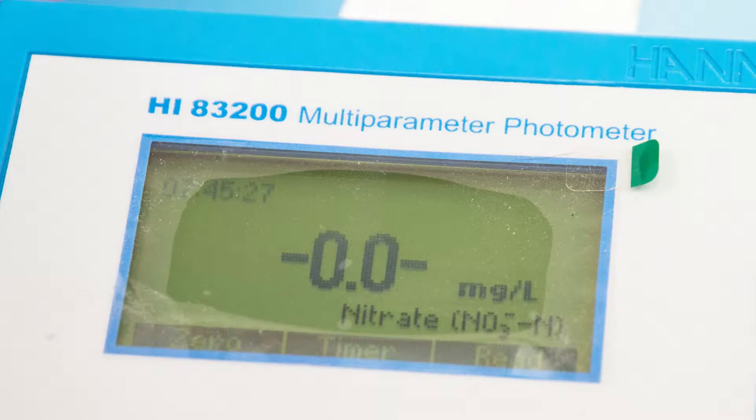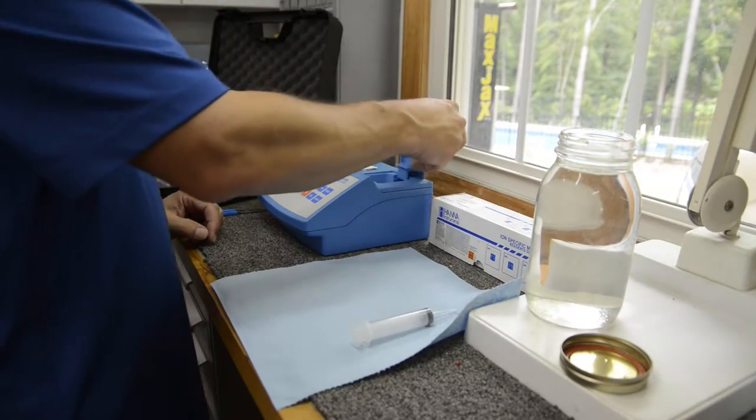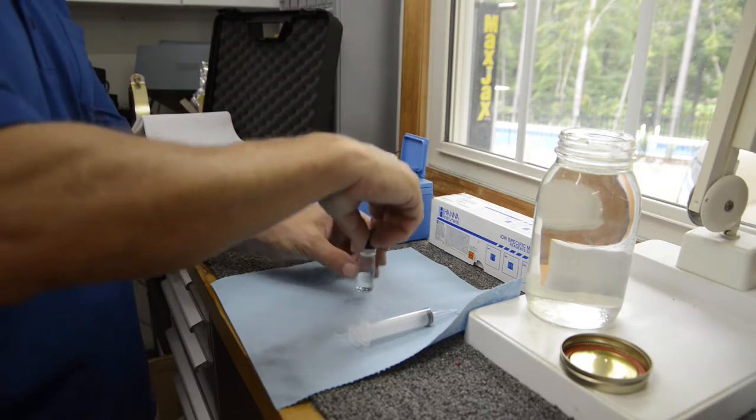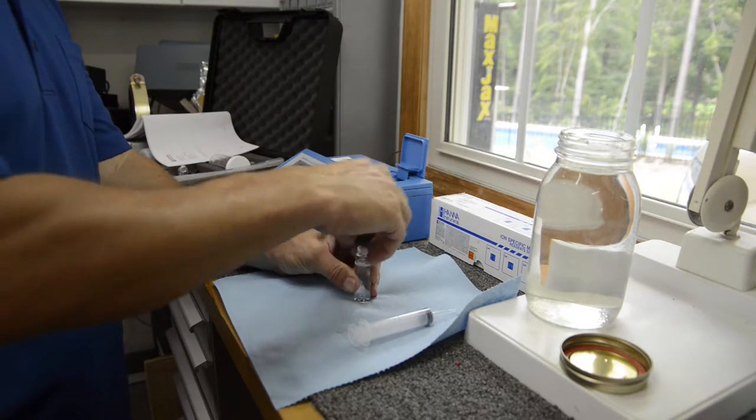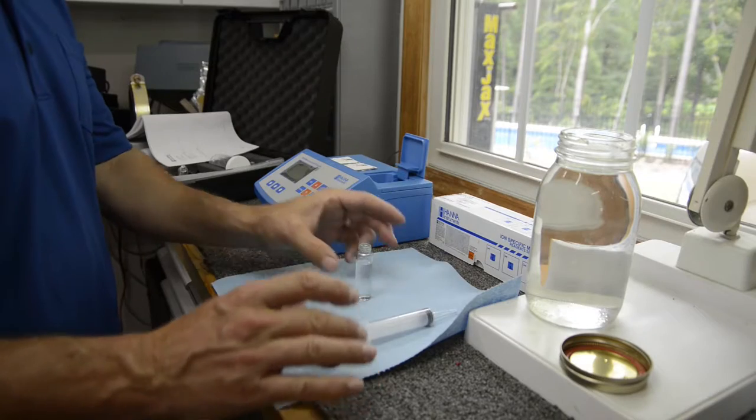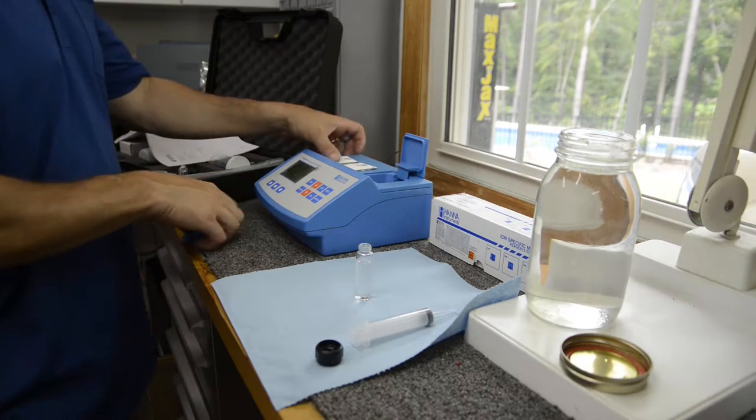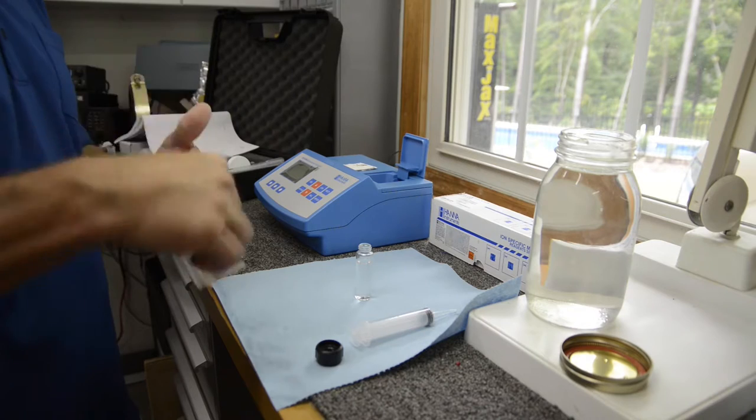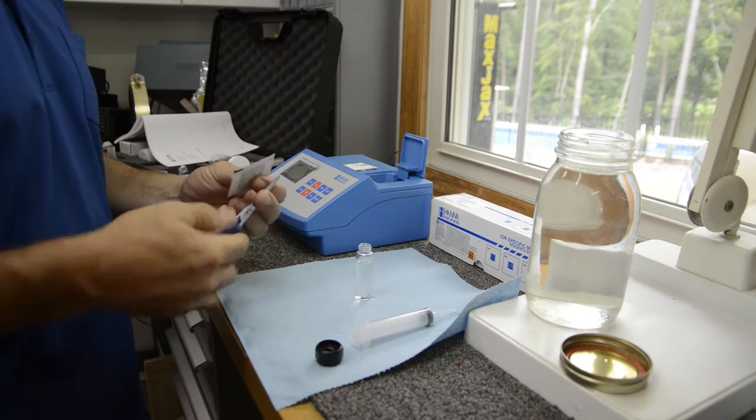So here we are - zero point zero. Now we're going to add in a reagent, and what a reagent is, is something that will colorize the water. It's a powder, and they have reagents for different things, like nitrate, copper.